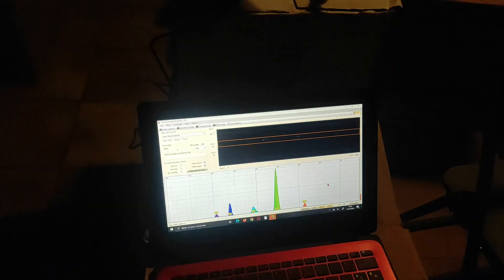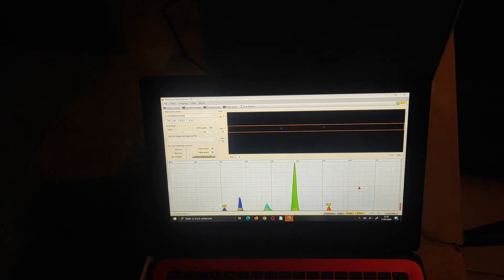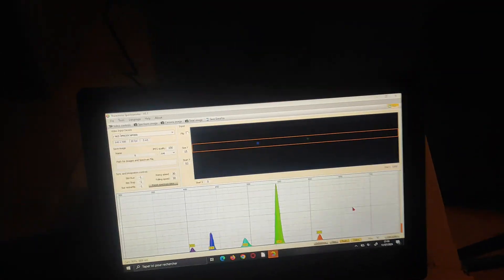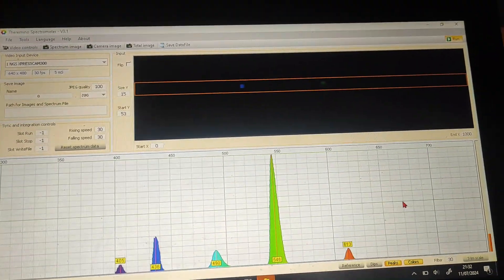Finally, I managed to improve the range of observation by using a different DVD grating, and after a quick calibration with the fluorescent bulb, we can observe 4 peaks on the camera, and the software even sees a 5th orange one. The range is from 300 nm in UV, up to 750 nm at the limit of infrared, which is pretty good.